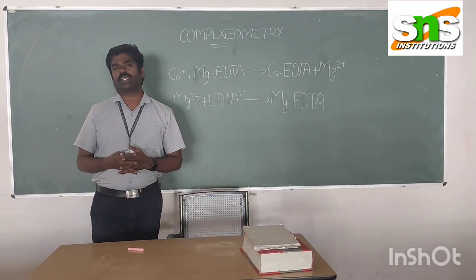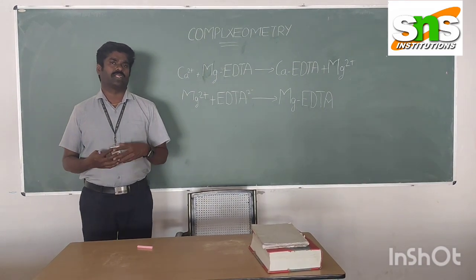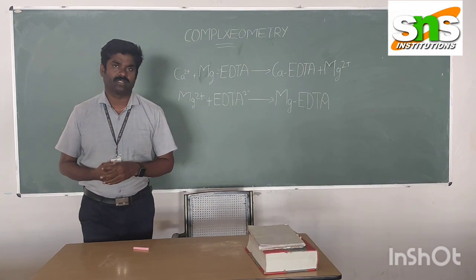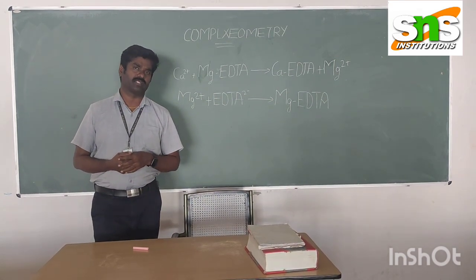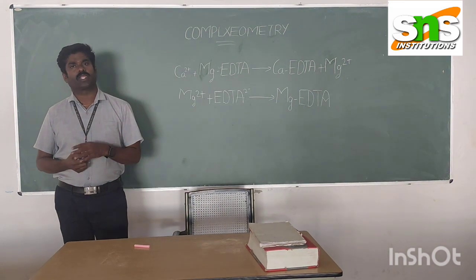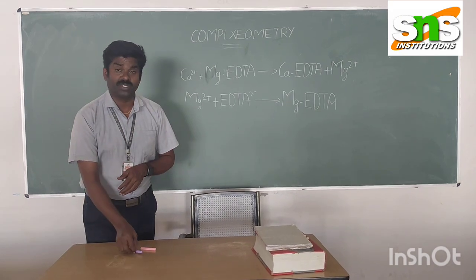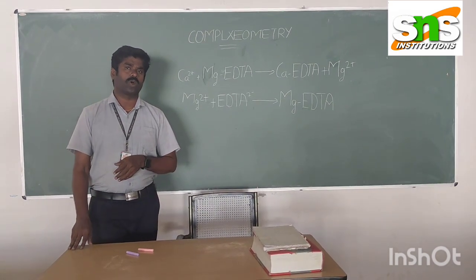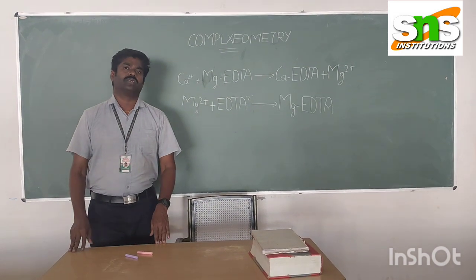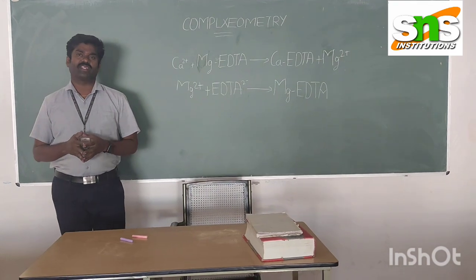So in quality control, we use three major categories. One is spectroscopic methods, another is chromatography techniques, and the third category is electrochemical methods of analysis. The fourth category is volumetric analysis. It is an outdated technique actually. Based on volumetric analysis reports, we do not give any kind of certificate for the formulations. But it is one of the quality control aids.